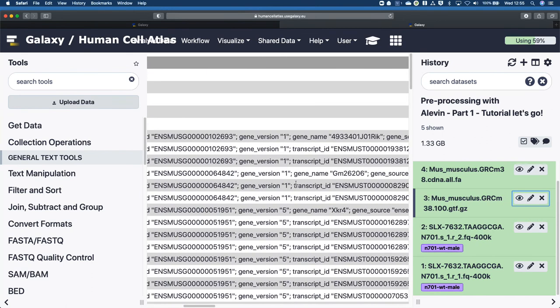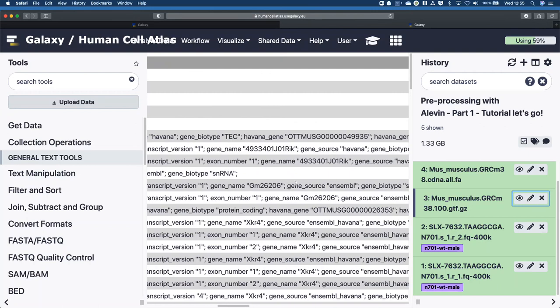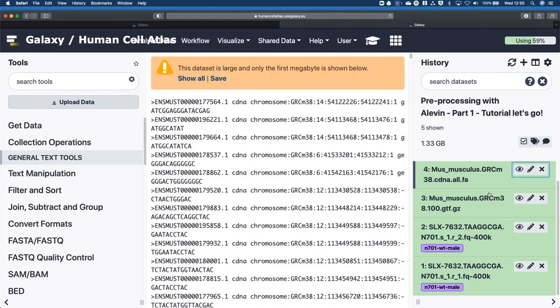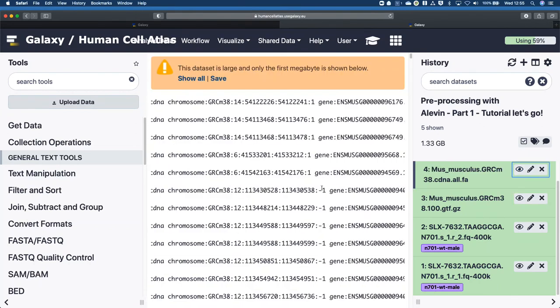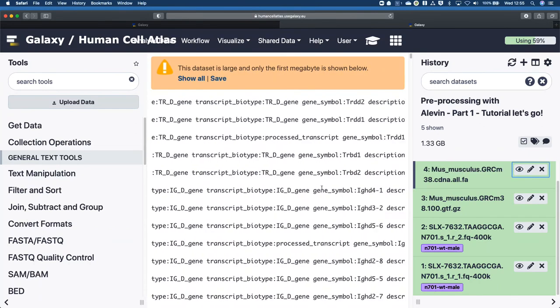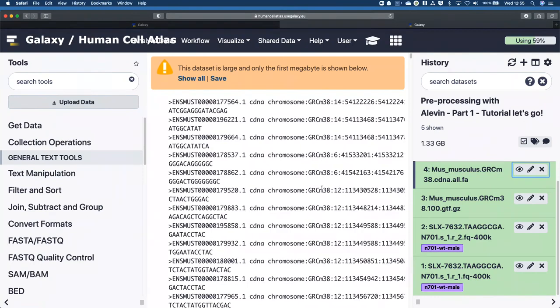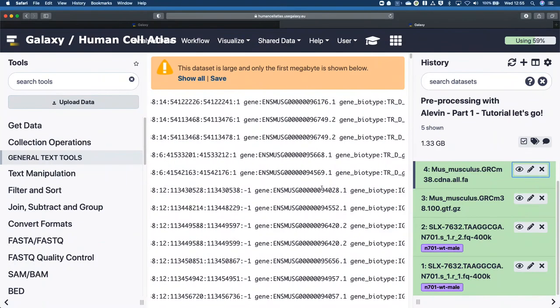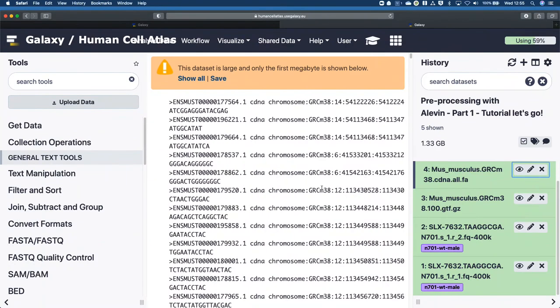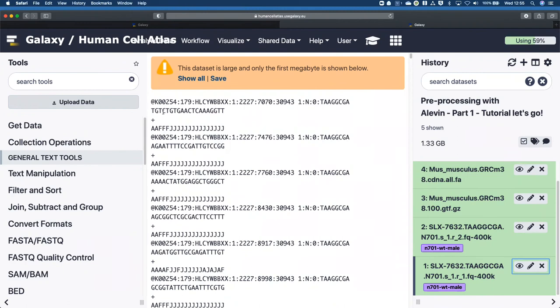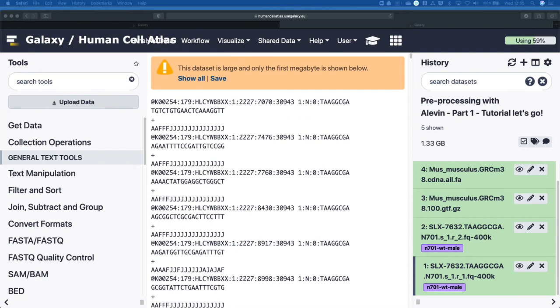We can look at all the information on a GTF file. 404 not automatically downloading, that's pretty good. We can look at all of our loads of transcripts information so you can examine this to your heart's delight. That's quite short. I wonder why that is. Read the tutorial. And now we're going to start actually doing stuff.